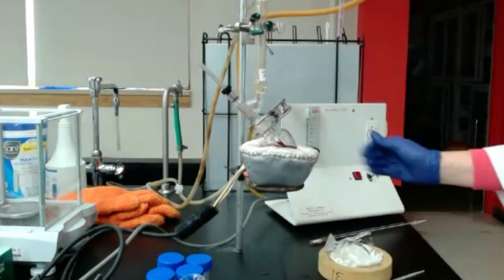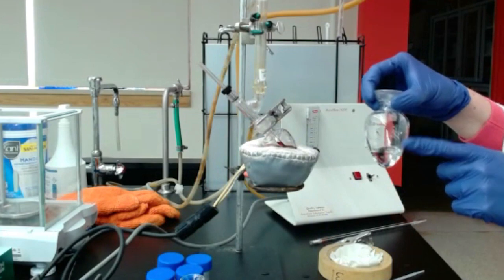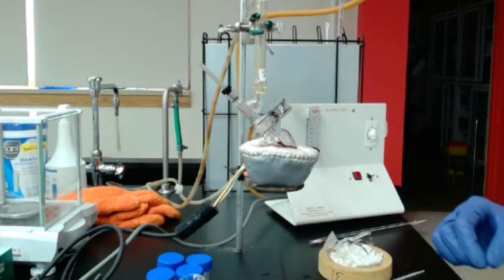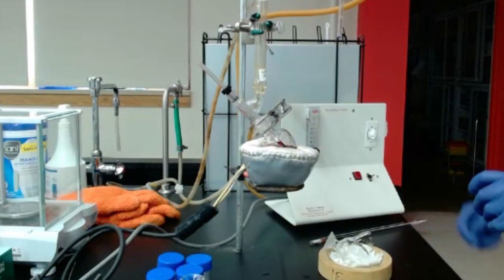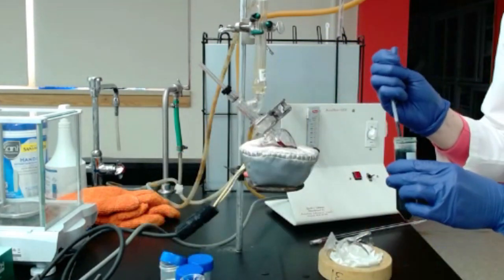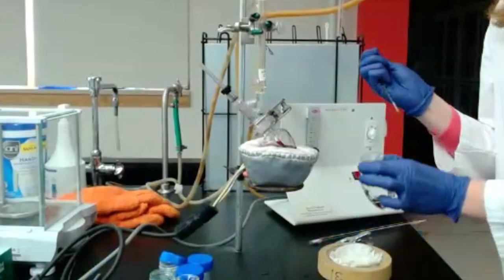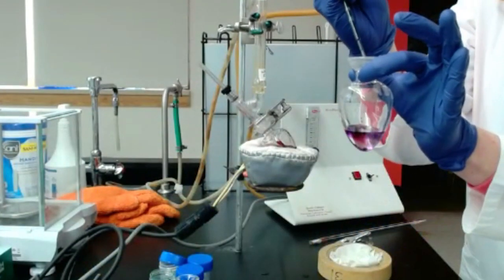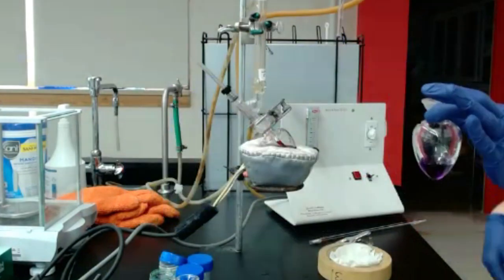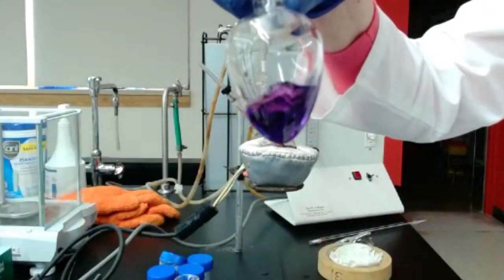Okay. So in that flask, we have hydrogen peroxide. We need to put the color indicator, so a few drops of color indicator, until the color is pale green. But it might not be pale green at first. It's 3 to 4 drops of that color indicator. But you see it's more purple than pale green.